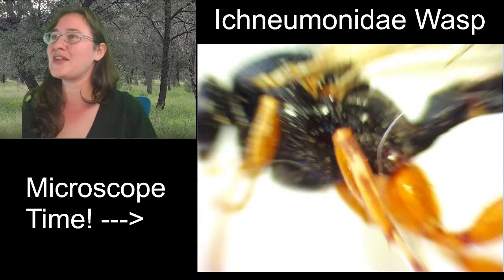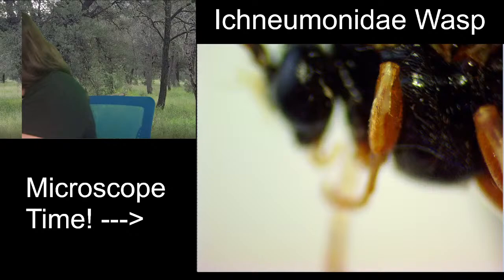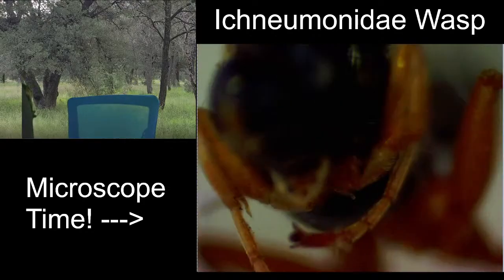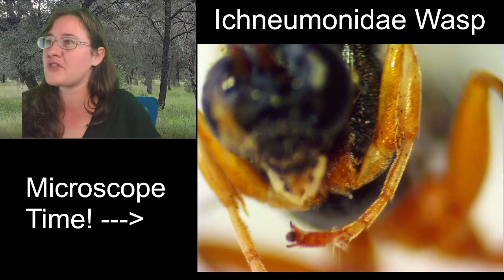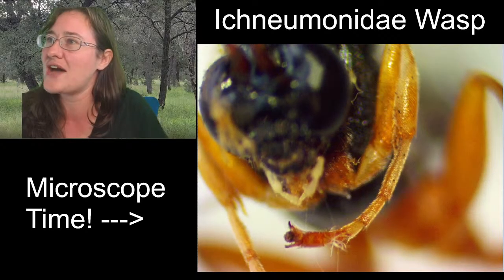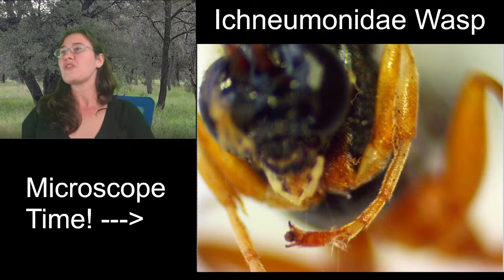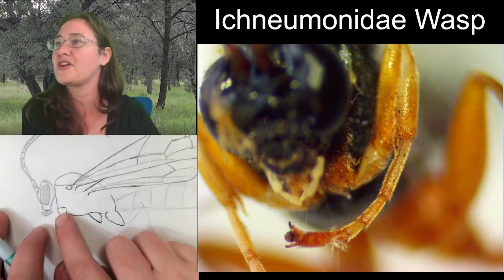So I'm going to zoom in over and we're going to look at our front leg. I might turn the specimen so that we are looking more at it from the front side, yes, that'll be better, so that we can see more of the leg in focus at one time. This is actually also a pretty good shot of those palpi. Look how pale they are. Wow. Okay. So I like this angle for sketching our front leg, or at least so that you can see all the characteristics in the front leg.